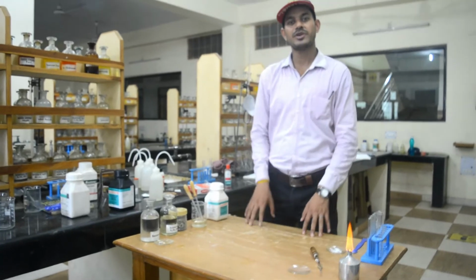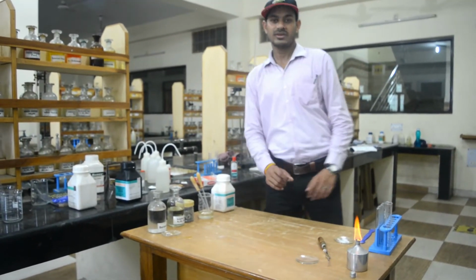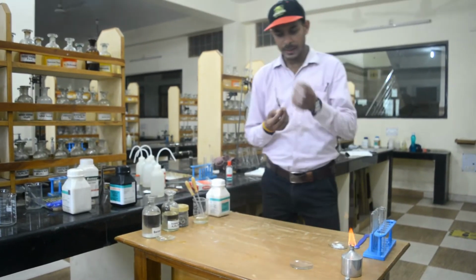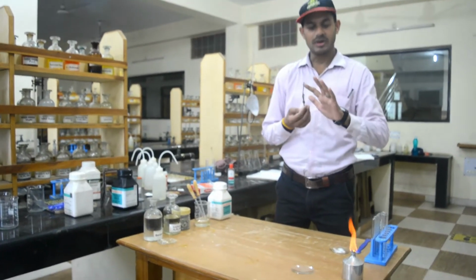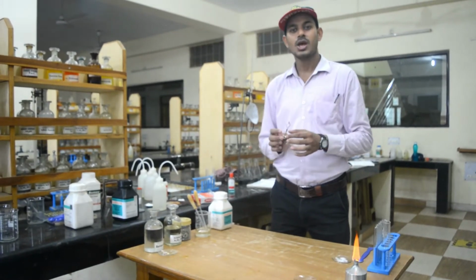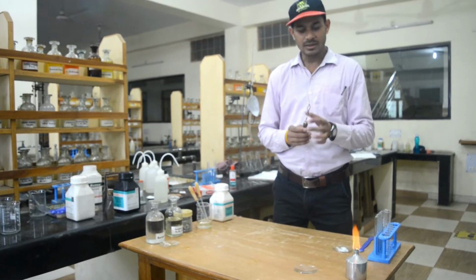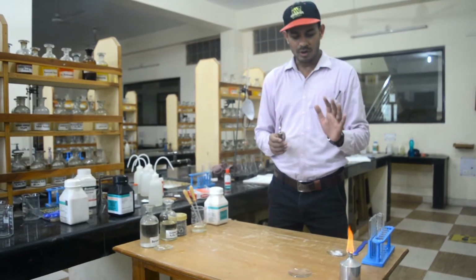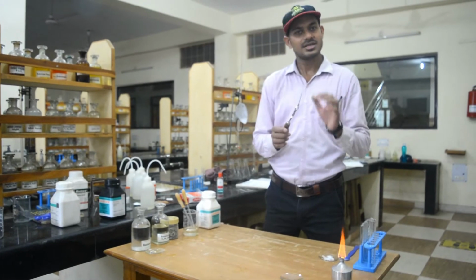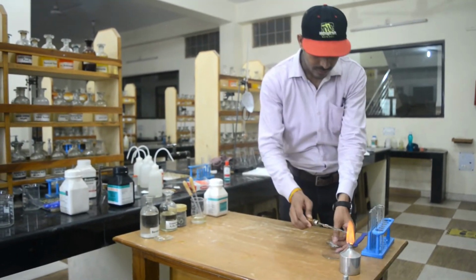The first reaction we will do is the combination reaction. In that, I am having a magnesium ribbon. I have already rubbed it because it forms a magnesium oxide layer. I have removed that layer, and now it is ready to burn. Now what will happen when this burns? Let us see what it forms.